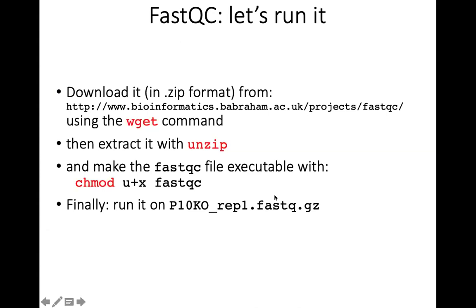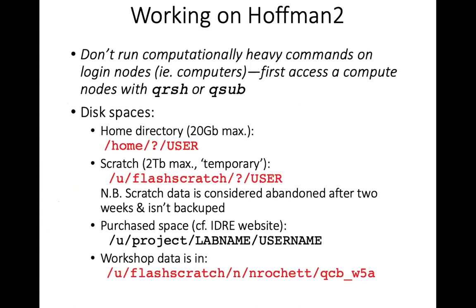And so just to remind you, this is where the workshop data is. This is the full path for the workshop data. This slide is slightly different from the one on the Hoffman 2 PDF. So this is currently where you are.